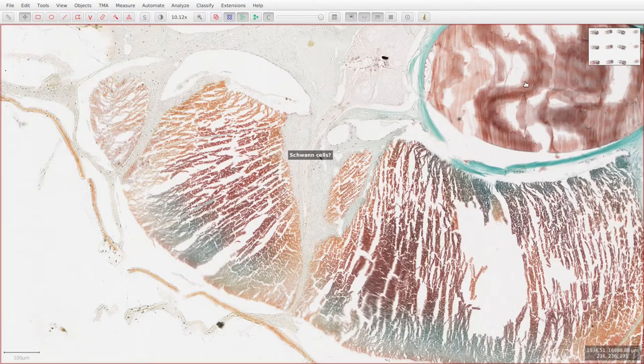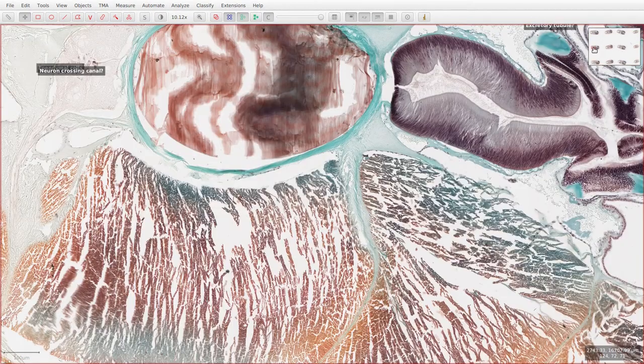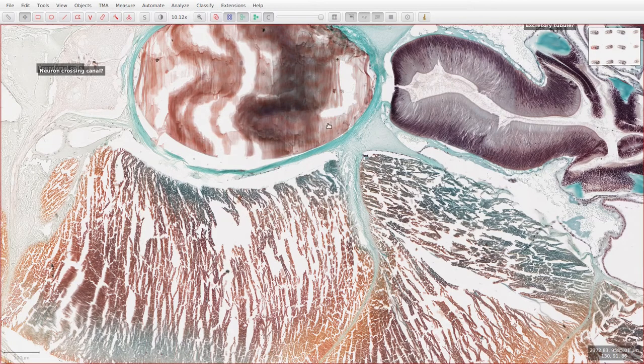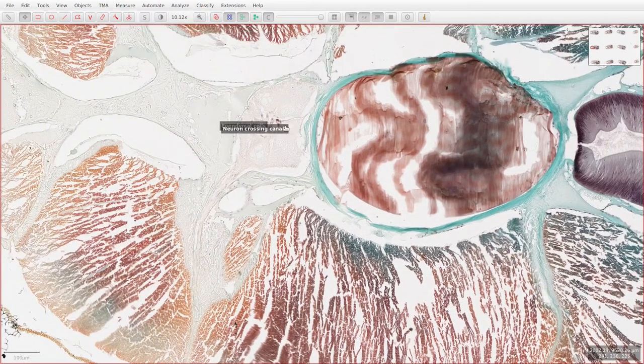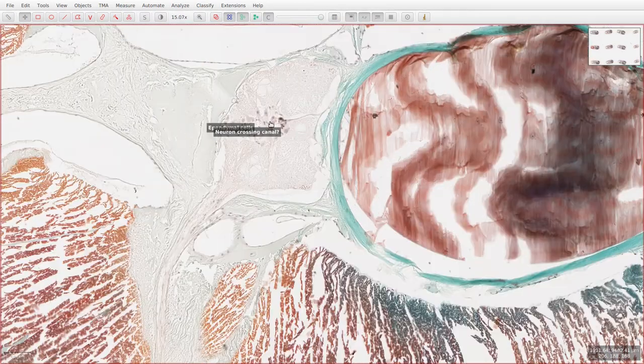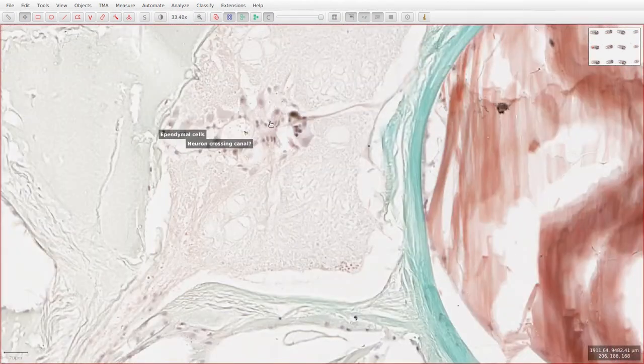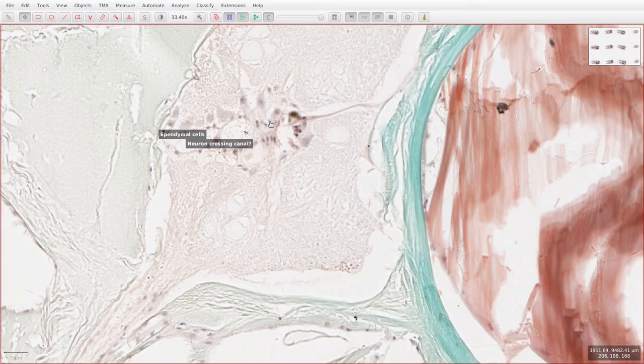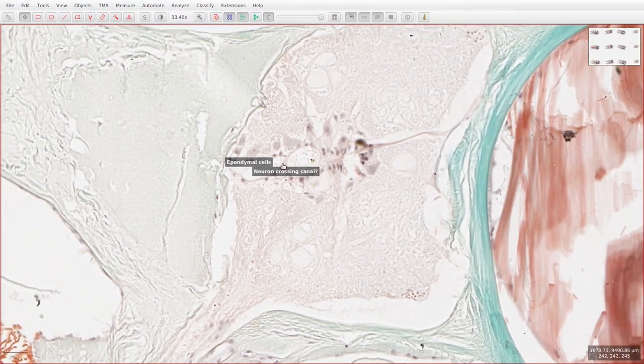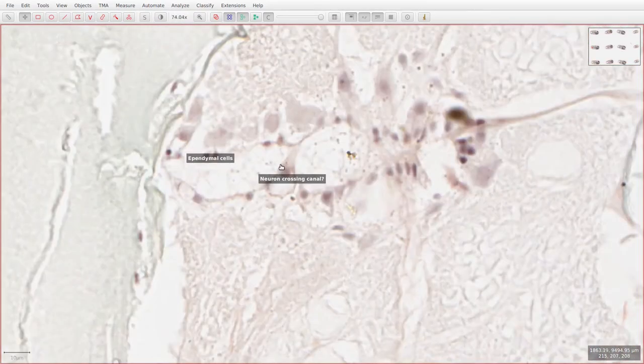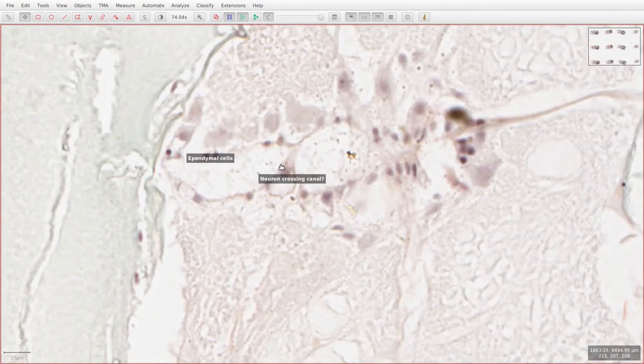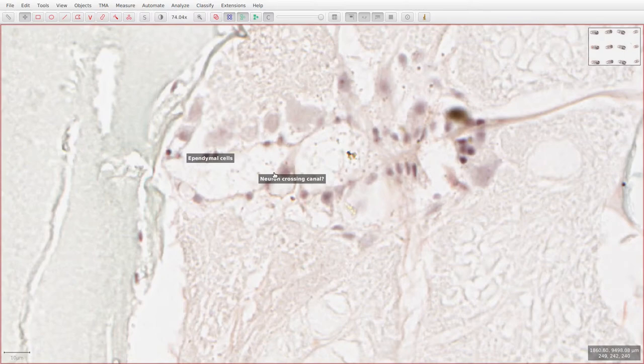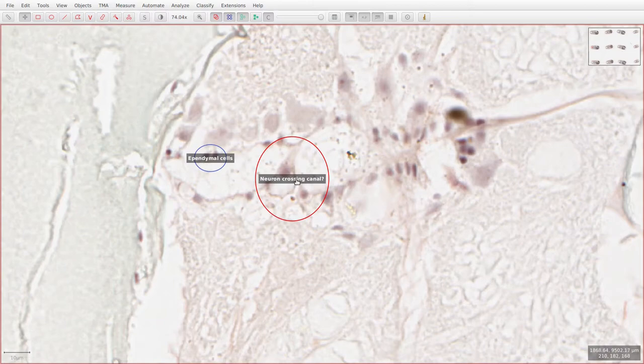If we move on to the neurons, now of course the neurons in amphioxus are extremely complicated, so I won't even attempt to identify all the different subtypes. They often extend processes across the central canal, and I think this is one here. If I turn on the annotation within the red circle, this looks like a neuron that's extending a process across the central canal.